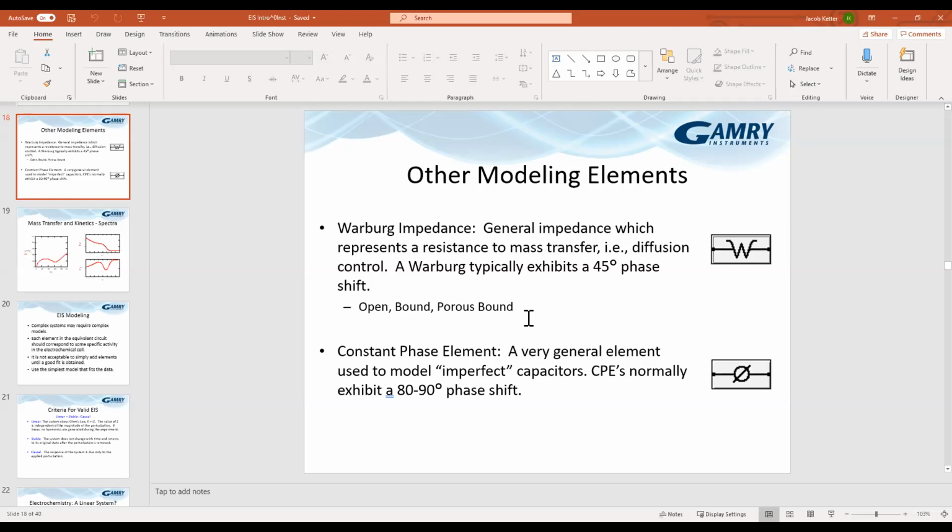Okay, let me see here. We have a lot of questions here, so I'm just asking everybody to have some patience as we work through them. We had another question, and this is probably relevant to everybody. Are there any special precautions to consider to prevent equipment damage while operating or while obtaining EIS spectra?